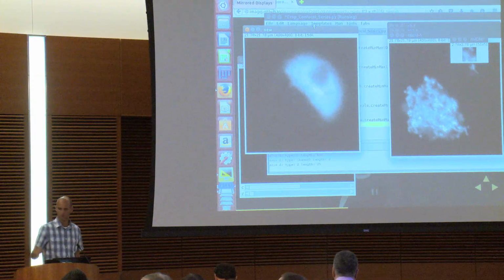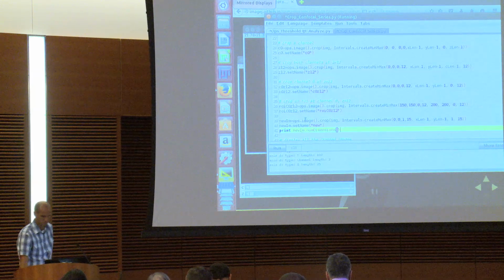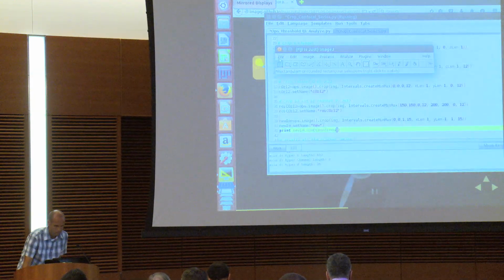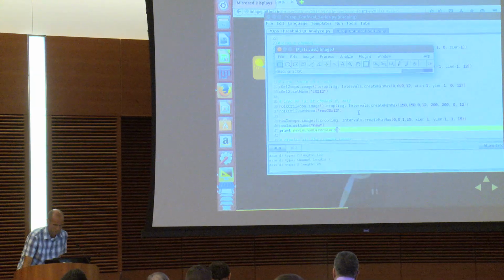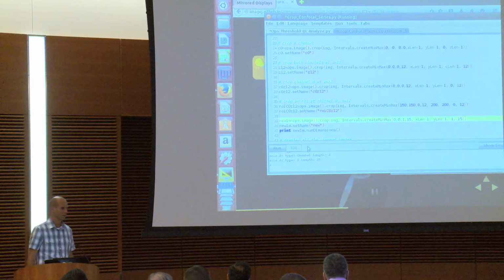Just throw a numDim call on there and see the number of dimensions. Because everything's coming back as input stuff, right? So all he has to do is write that numDim. I don't remember. This is actually a big topic of the hackathon: lazy ops versus, do you just make a view or do you do some data processing? So it is 2. Yeah, so it did reduce it.